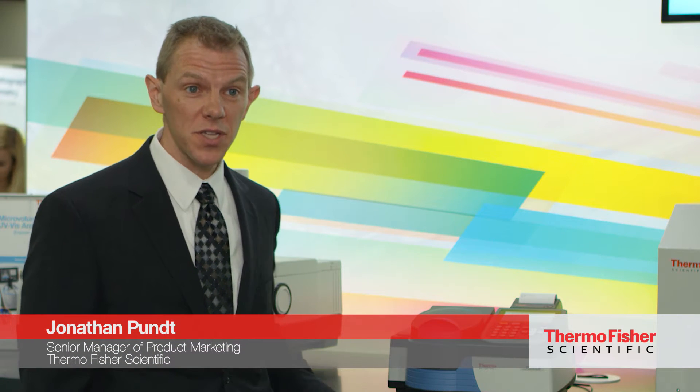We're here at the Thermo Fisher booth and I'm really excited to tell you about the Thermo Scientific Genesis 30 visible spectrophotometer. The Genesis 30 is our newest addition to the Genesis product line within our molecular spectroscopy group, and it's really targeting two different users — we're looking to support educators and also lab managers in the QA/QC market space.